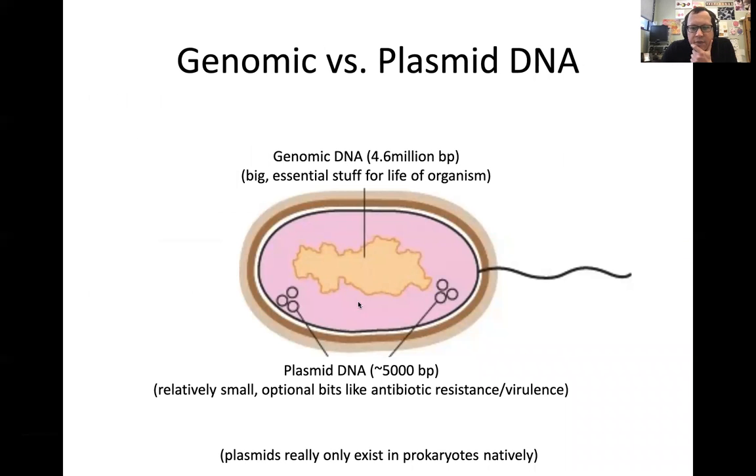And so if we think about our plasmid DNAs, they need to be packaged as well, right? That supercoiling that the bacteria does. And so if we were to take our plasmid DNA and run it directly on a gel, it's going to run weird because it's going to be all supercoiled up. And so that's why we need to cut our plasmid DNA with the restriction enzymes.